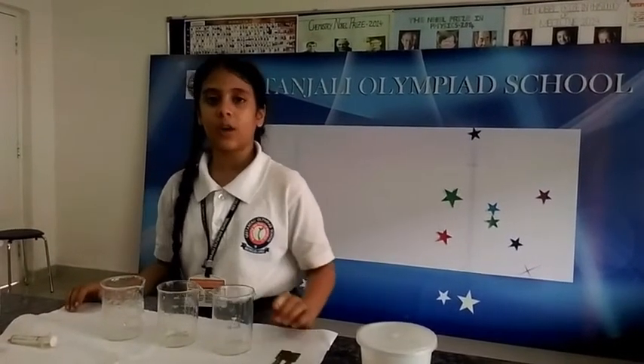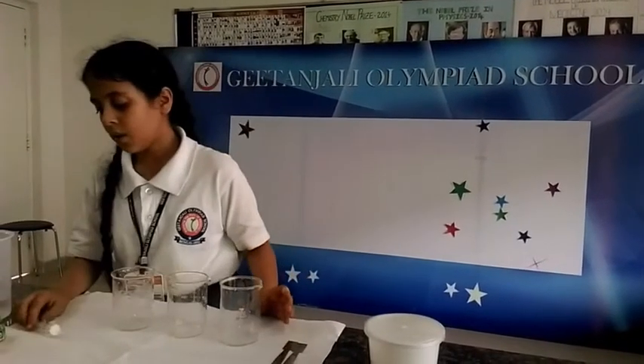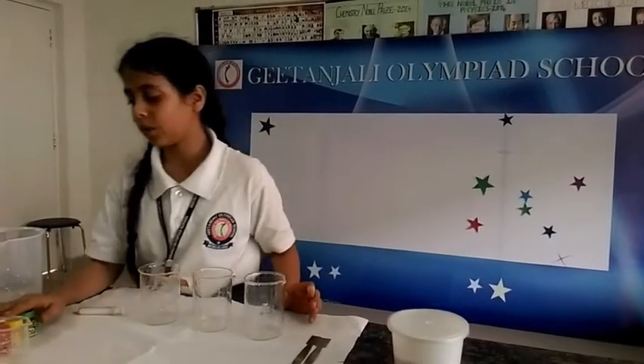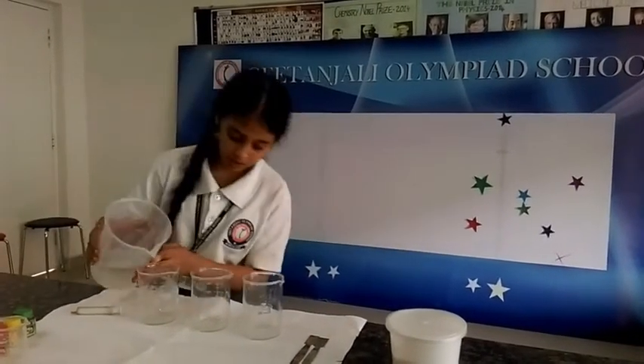The materials required for my experiment are 4 beakers, a white syringe, and food colors. Now I am going to add water in the beakers.